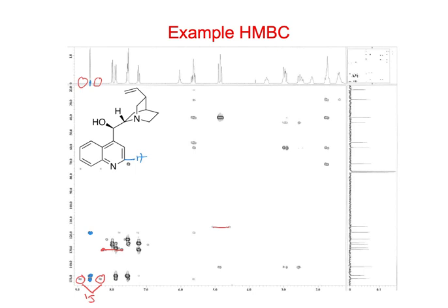So those satellites are produced by C13 carbons? Yes, we can only see coupling to C13 carbons, because they're the only NMR active ones. I'm not sure quite why it does this, but I've seen this before too: this is supposed to show multiple bond coupling, but the one bond CH coupling shows up sometimes, at the C13 satellite peaks. And that's a way that we can identify them.